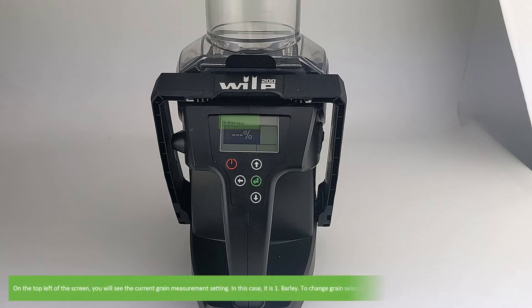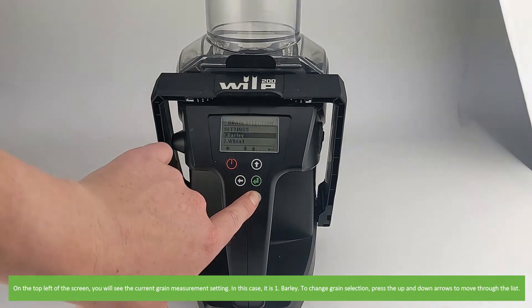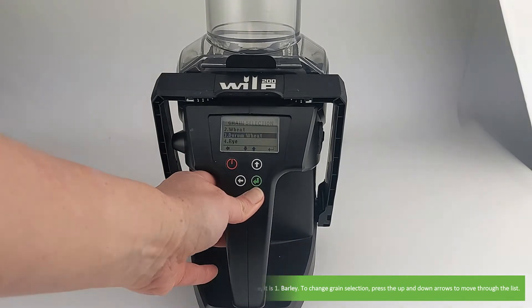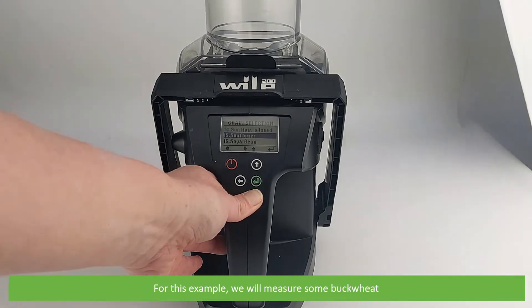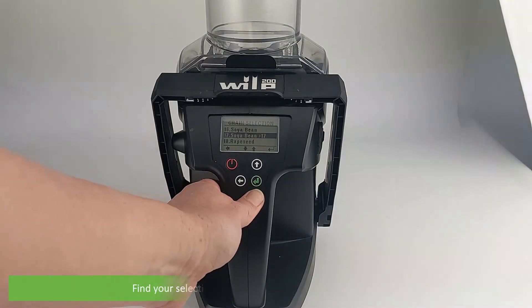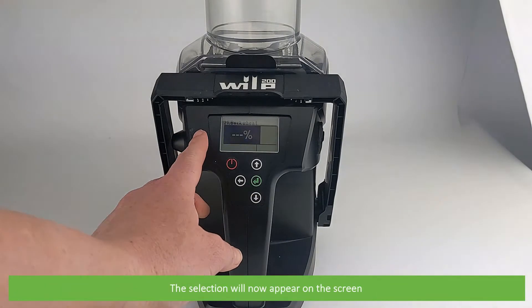On the top left of the screen you will see the current grain measurement setting — in this case it's barley. To change the grain selection, press the up and down arrows to move through the list. For this example we will measure some buckwheat. Find your selection then press the green enter key to confirm. The selection will now appear on the screen.